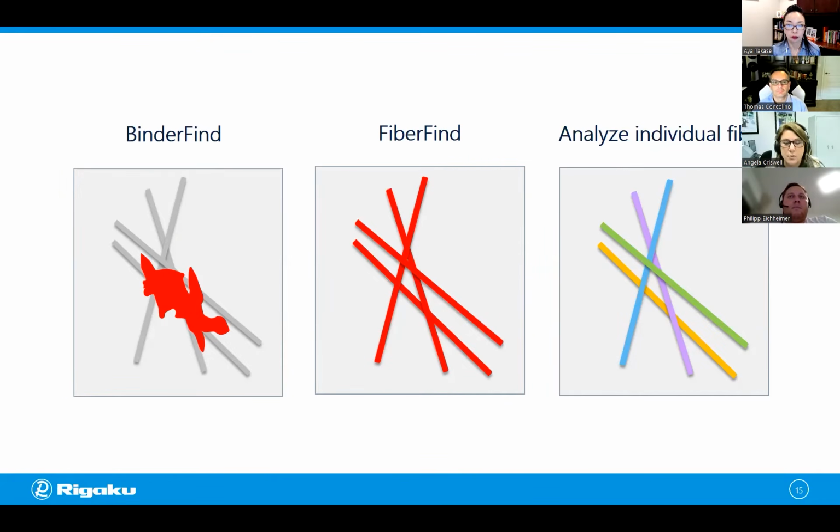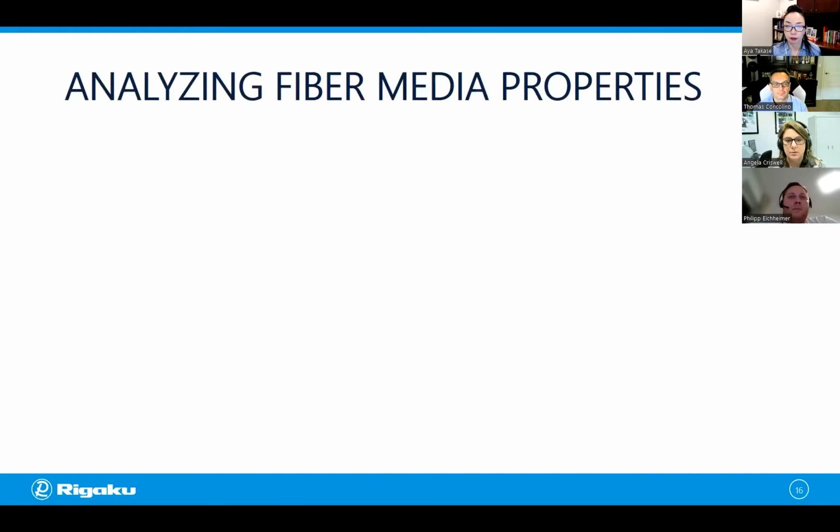I expect they're working on other ones going forward. Maybe Philip can mention that. But for now, we're just going to work with circular fibers. If you have things like hollow fibers or trilobal fibers, you might need to create your own ground truth to work with those.